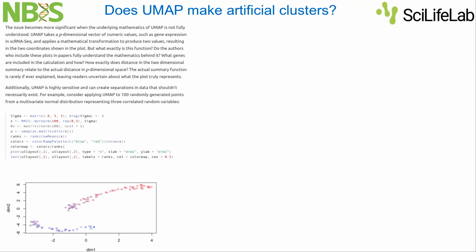Please go ahead. Yes, thank you, Nikolay. I had a question also related to heterogeneity in tumors. In most cases, at least for my studies, we have different heterogeneous populations: two very distinct populations, and then all the transitions in between. In that case, if we rely on the UMAP, can we say that this transition between the two defined clusters is closer to one end than the other, or can't we make such a conclusion? Do we say that we just have a transition, which we can retrieve with trajectory analysis or something? Can we draw any conclusion? That's my question.